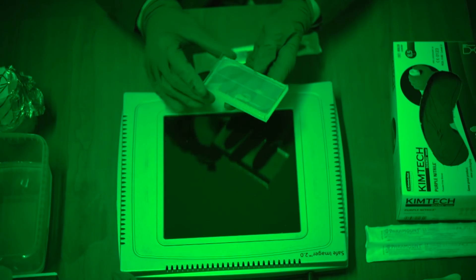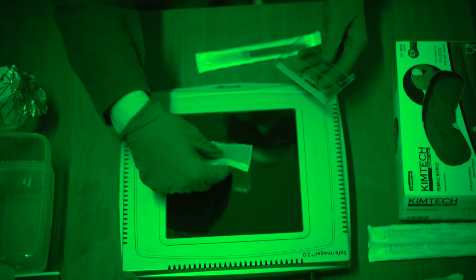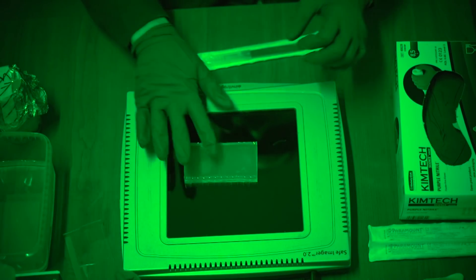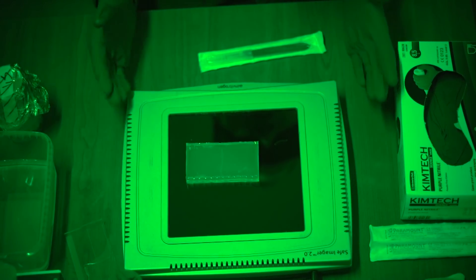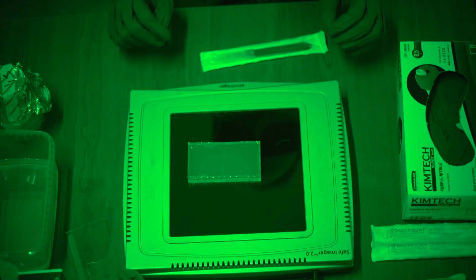Here is the gel that we're going to be working with today. I will cut the bands from this gel and we'll go through the protocol two times — first in the natural light so that you can see the manipulations, and then second using the fluorescent light so that you can hopefully see the DNA that we're actually cutting.